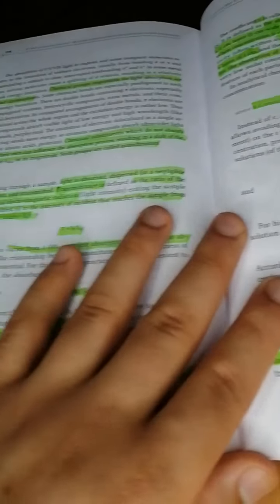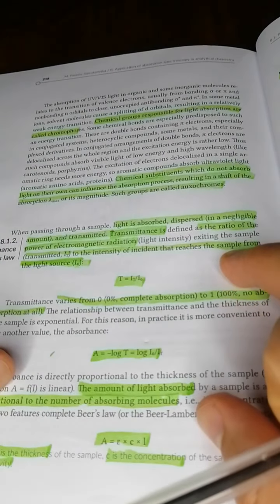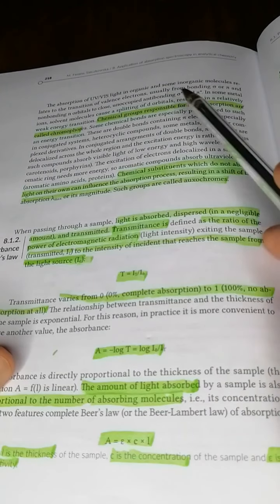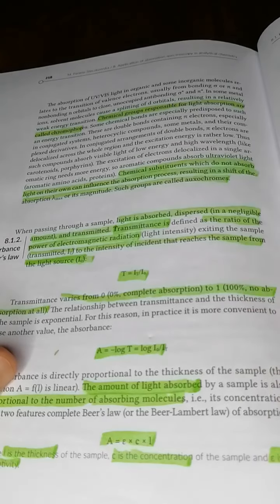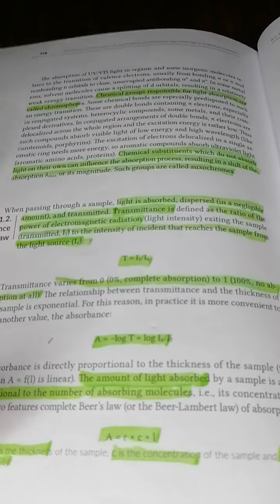Moving on. So now that we know the concept of absorption spectroscopy, there are two terms that we need to know what they mean, okay, that we need to identify. And the first one being chromophores. Chromophores are the chemical groups responsible for light absorption, okay, at certain wavelengths.